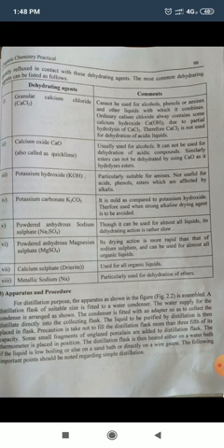Next is the apparatus and procedure of this practical. For distillation purposes, the apparatus as shown in the figure is assembled. A distillation flask of suitable size is fitted to a water condenser. The water supply for the condenser is arranged as shown. The condenser is fitted with an adapter so as to collect the distillate directly into the collecting flask. The liquid to be purified by distillation is then placed in the flask.